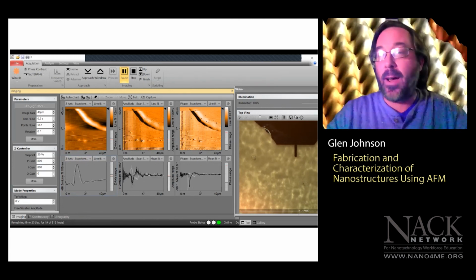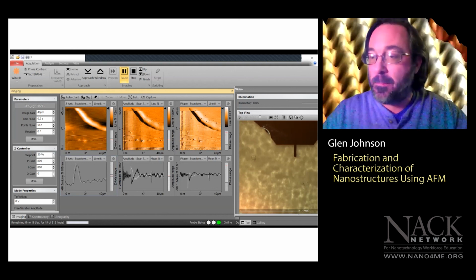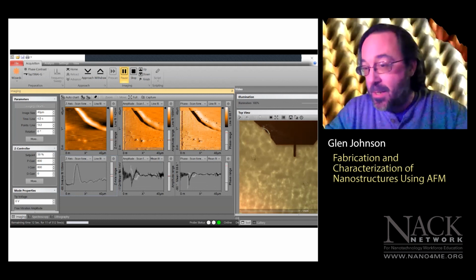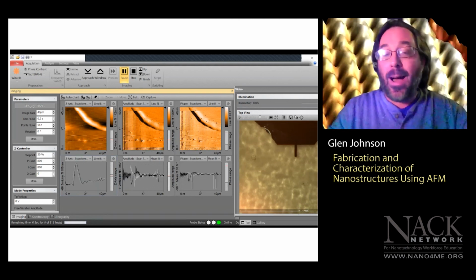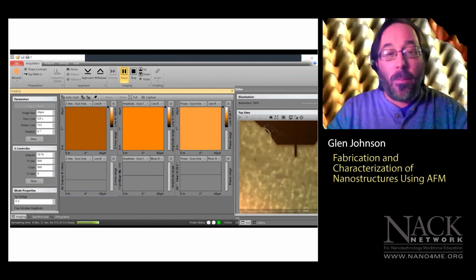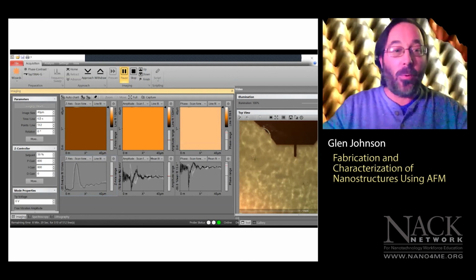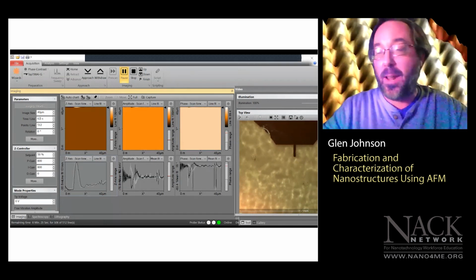So we can visualize, I think of it as a real-time cross-sectional analysis. Our black line is our positive X direction of this scan. So the black line is moving to the right, or the white line is moving to the left. Ideally, we want to get these as close to superimposed as we can. We're not going to be able to get it completely superimposed, but we can get close. I can always play with these gains to try to clear that up.